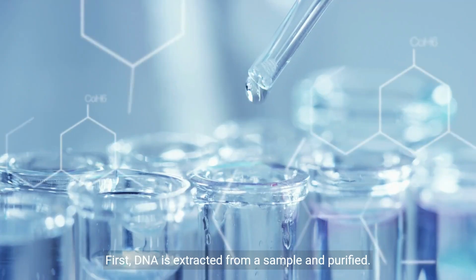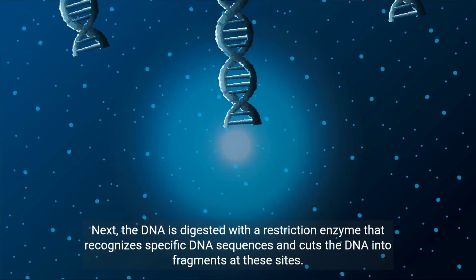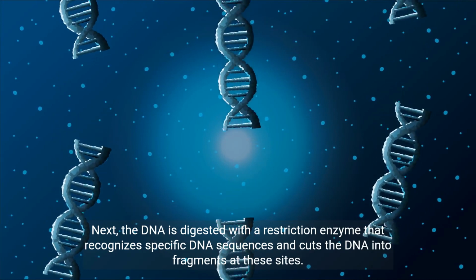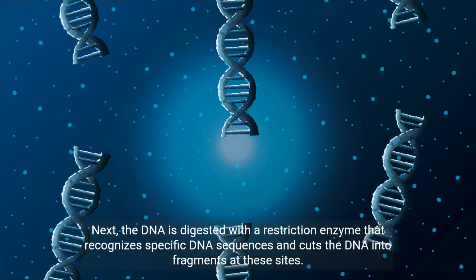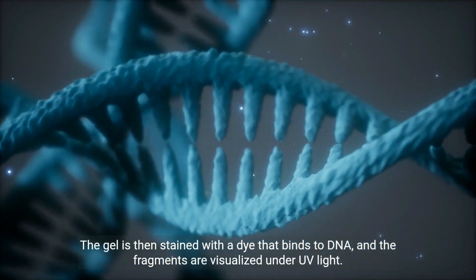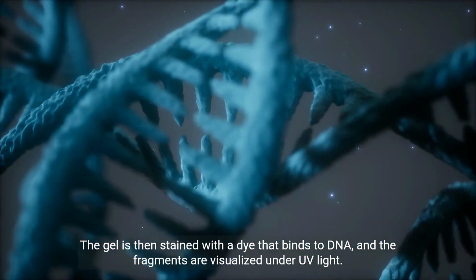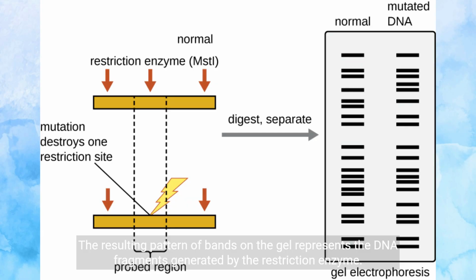First, DNA is extracted from a sample and purified. Next, the DNA is digested with a restriction enzyme that recognizes specific DNA sequences and cuts the DNA into fragments at these sites. The resulting fragments are then separated by size using gel electrophoresis, which separates the fragments based on their length. The gel is then stained with a dye that binds to DNA, and the fragments are visualized under UV light. The resulting pattern of bands on the gel represents the DNA fragments generated by the restriction enzyme.